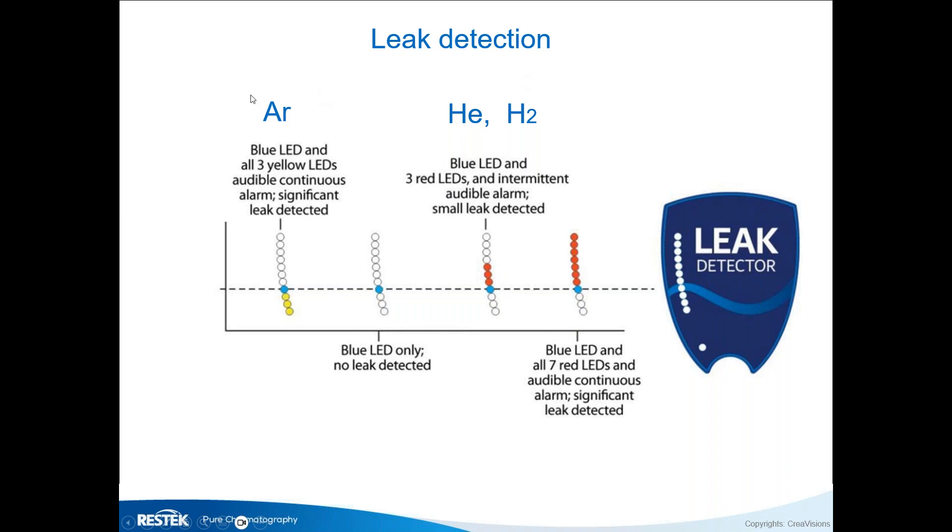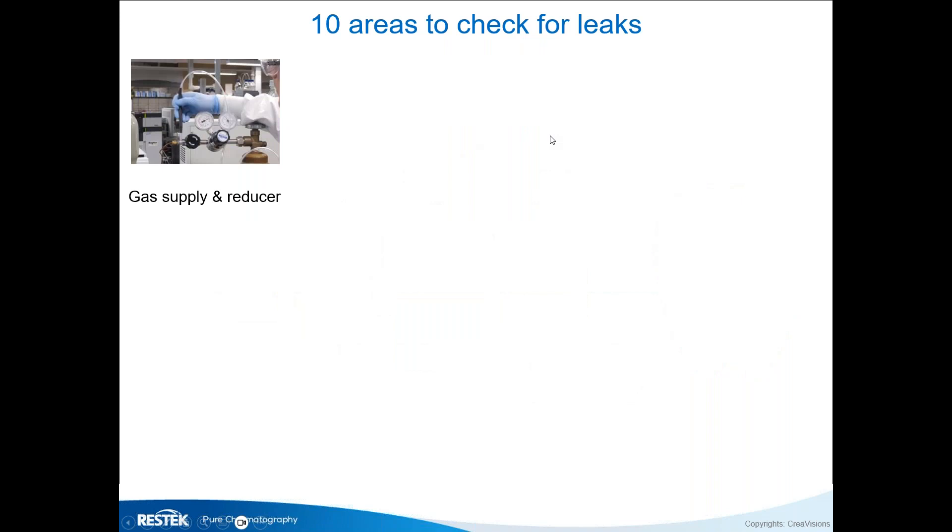If you use argon, its conductivity is lower than air, so you get an opposite response — a yellow signal. The same applies to nitrogen, though the sensitivity for these gases is not as high, so this will only indicate a fairly large leak. For helium and hydrogen, the detector is very sensitive.